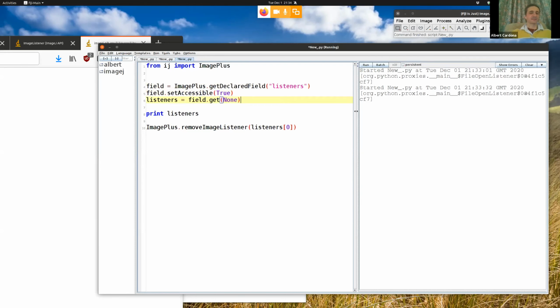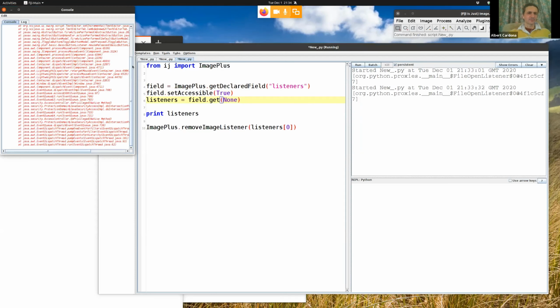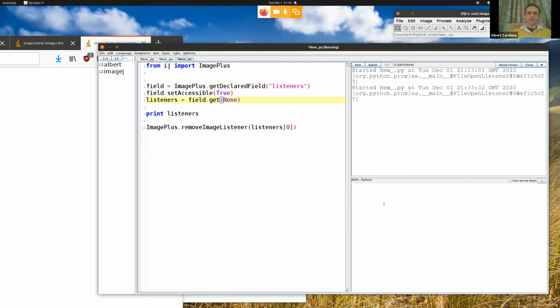That can be very big. And so sometimes you just don't know what you're looking for. Just to demonstrate that further, I can push here persistent. There's something it didn't like. I'm going to ignore. And now here it opens a REPL. This means, I forgot what REPL stands for, but it's basically an interactive prompt. And what we can do here now is say print, basically.